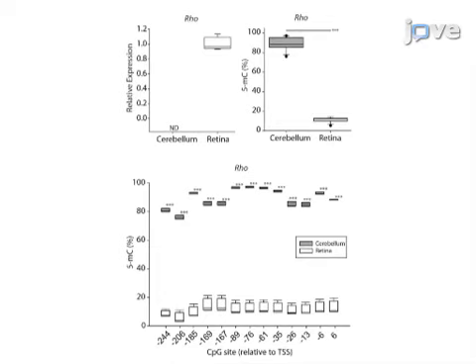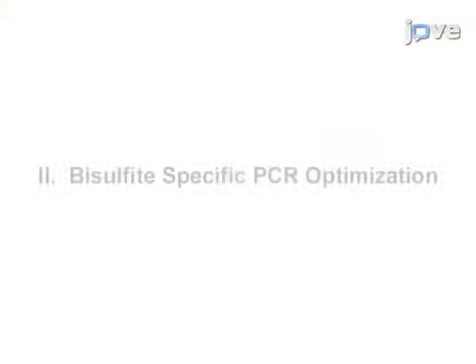Ultimately, bisulfite amplicon sequencing, or BSAS, can be performed to precisely and accurately quantify the CpG methylation in any region of interest from any model organism. The main advantage of this technique over existing methods, like Sanger sequencing, is that BSAS provides accurate and precise CpG methylation quantitation in a rapid, high-throughput manner, providing the opportunity to assay multiple regions in a high number of samples.